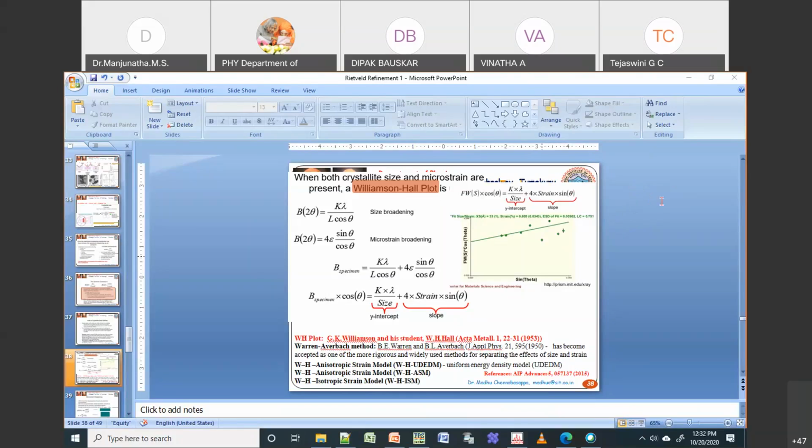Once you have a good atomic fit after refining your scale and everything, then finally, before stopping the refinement, you can always refine the ABC parameters. The reason is, if you try to refine ABC while doing atomic refinement, sometimes the peak you got with profile fitting will completely disappear. It will try to find a new position for the peak, and then it may collapse. So that is the reason you should not do that.